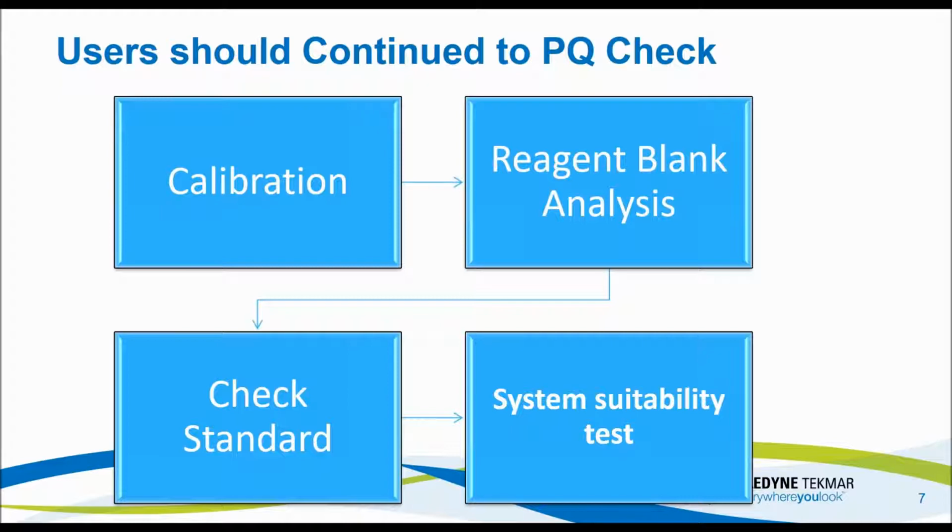And as long as those pass, I know my calibration is still good and the results in between those check standards are still good. I also run a blank every day. Again, that verifies that your system's not contaminated, or your acid solution or sodium persulfate solution is contaminated. So just checking to make sure everything's clean and good to go.